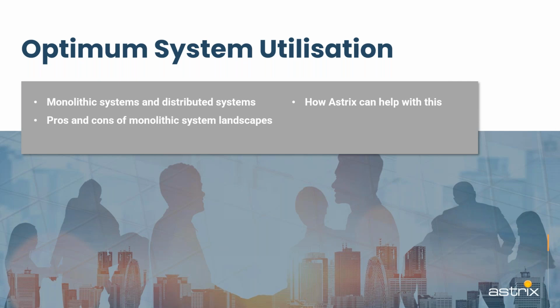So when it comes to these kinds of solutions, you also have to realize that there are hundreds, if not thousands of companies all over the world that are in exactly the same situation. I mean, everybody bought these things when they came out, and the majority of companies are still running their labs on these. It's also worth mentioning that the new generation of monolithic systems can actually negate a lot of the old problems that were there in the beginning.